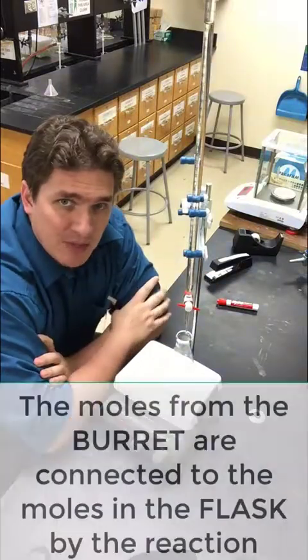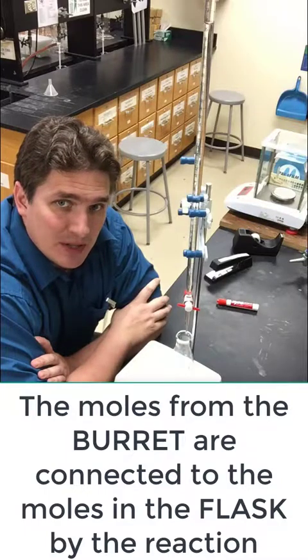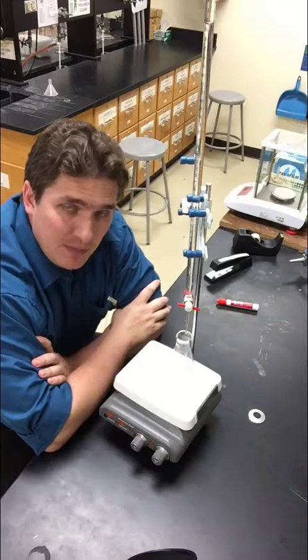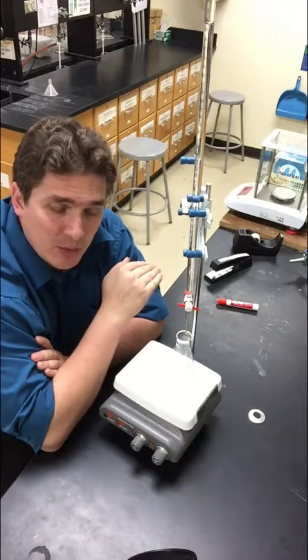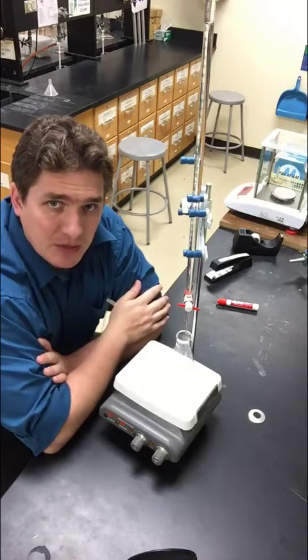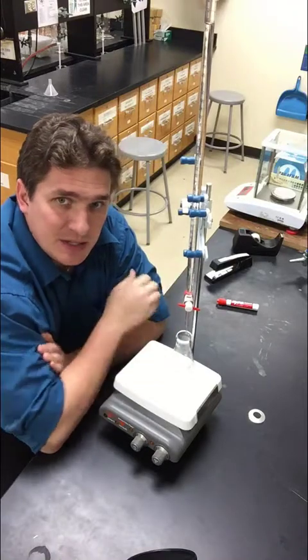And we're going to connect the moles of what's in here with the moles of what's in here through a reaction. So for a monoprotic acid titration against a strong base, something like acetic acid versus sodium hydroxide, it's 1-to-1. When we've hit equivalence, we've reacted away all the sodium hydroxide with acetic acid or vice versa. So this is one way of doing a titration. You add this to this until you hit equivalence.